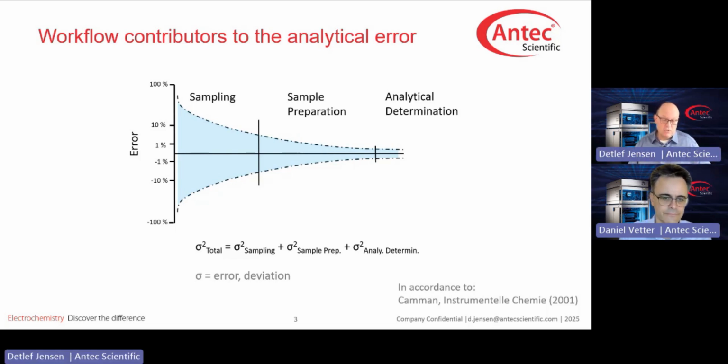Yes, it is huge. But as the analytical chemists that we are, let's focus on the contribution of sample preparation. When we talked about the content of this sample preparation, I thought that sample preparation is a series of decisions.